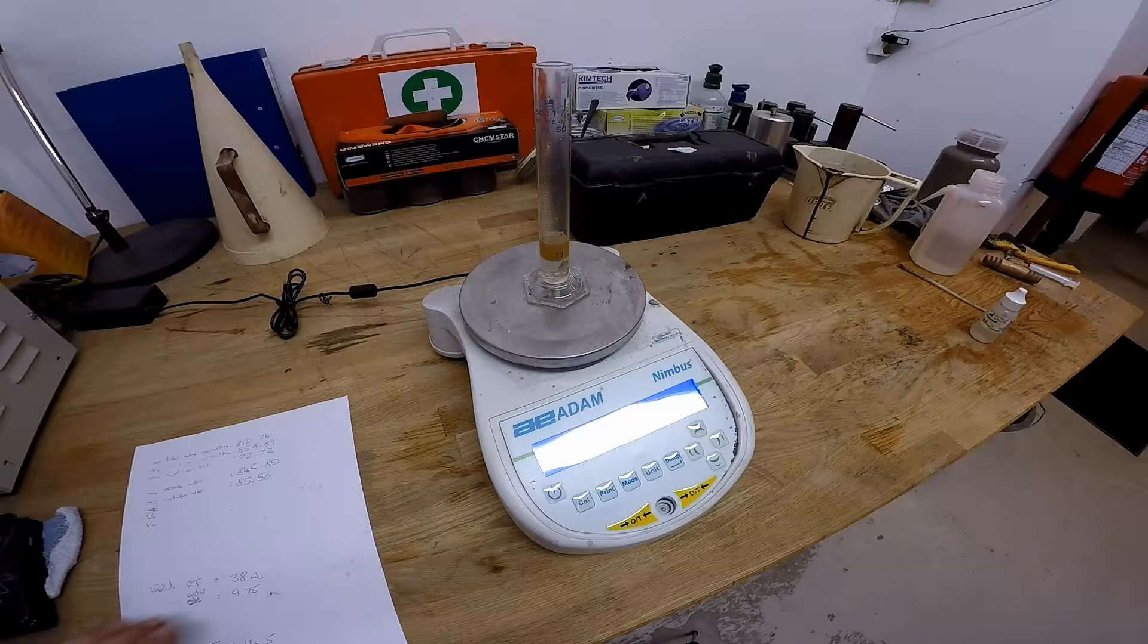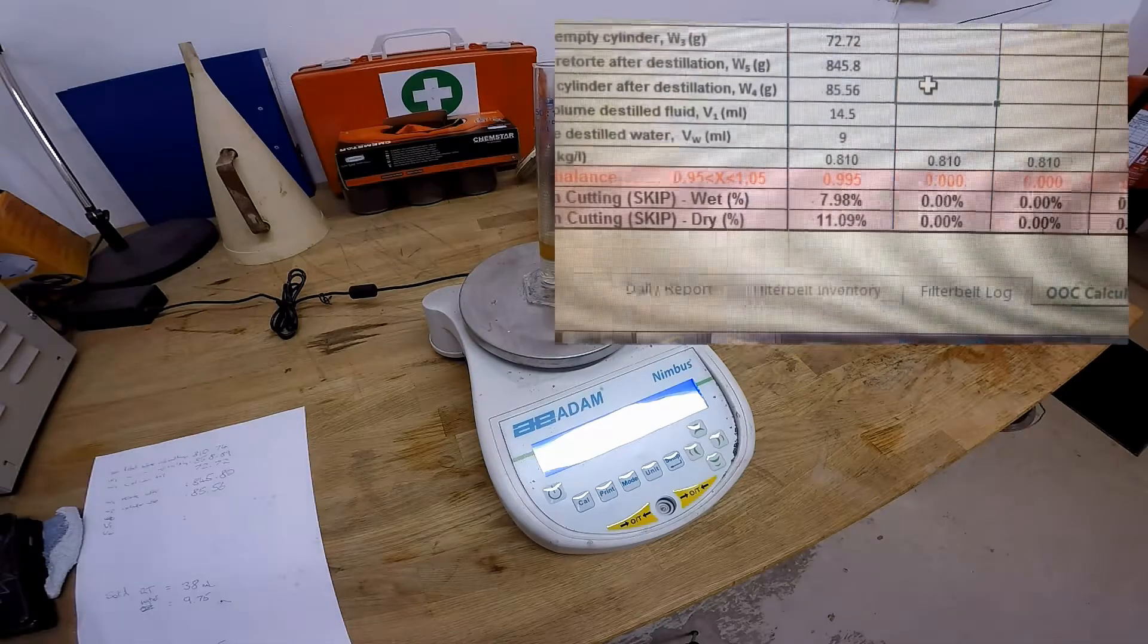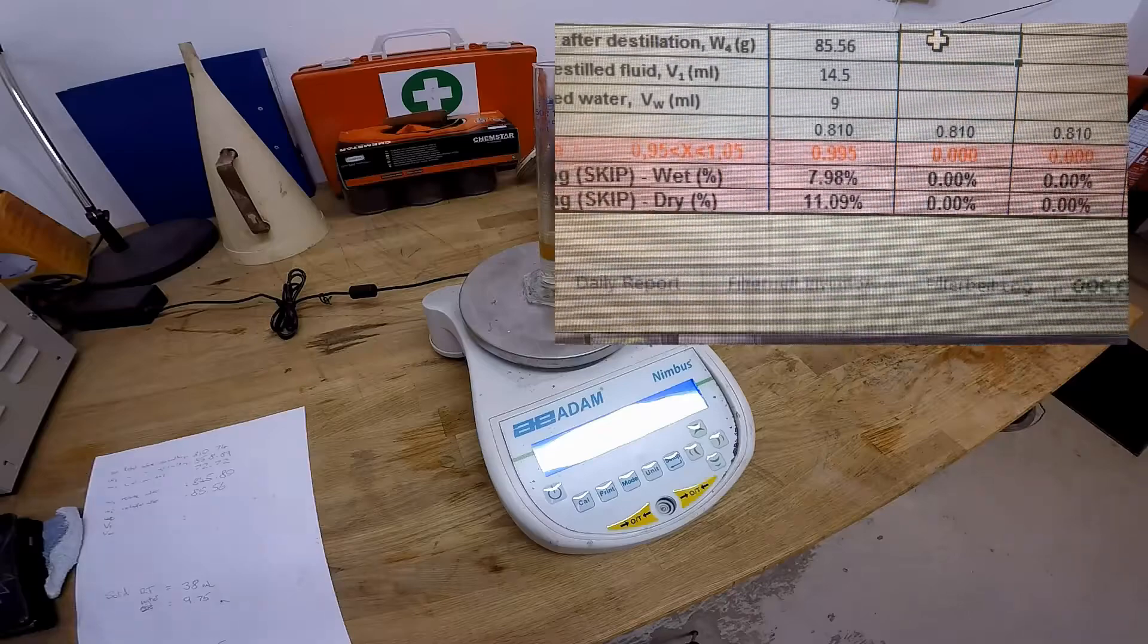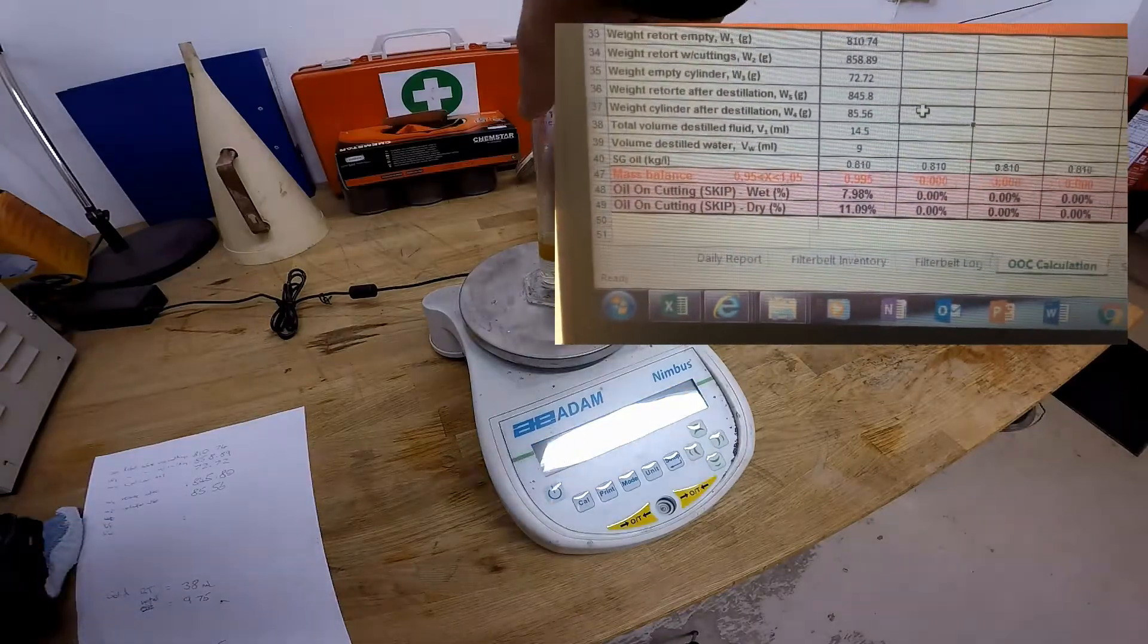So now since we've got all the figures, it will show us the calculation at the bottom and you can see wet and dry percentage.